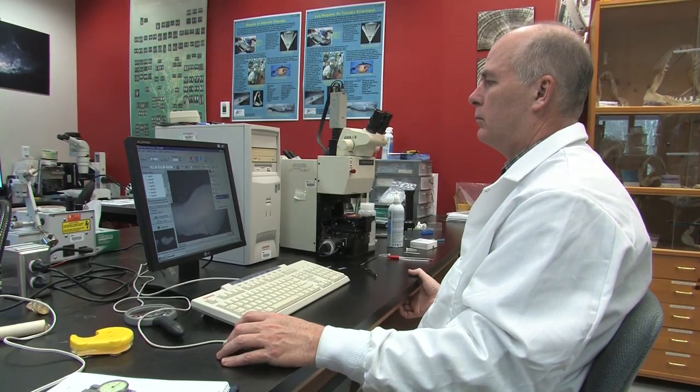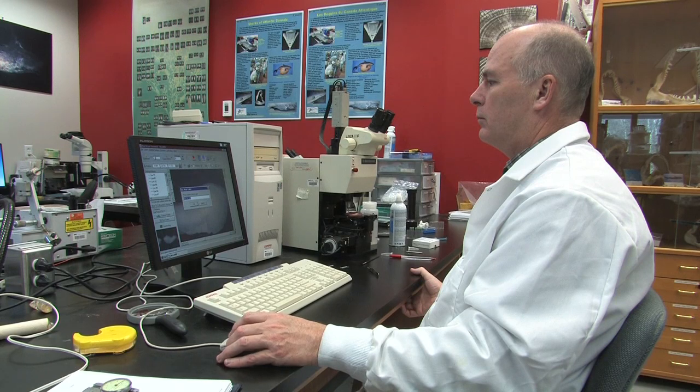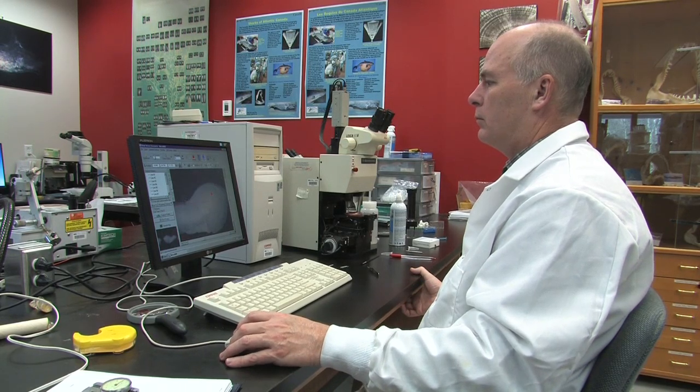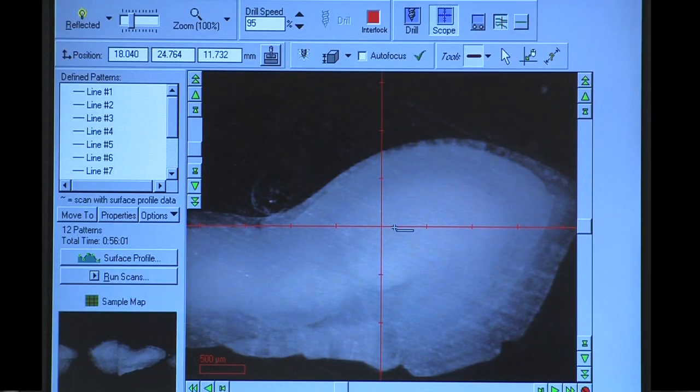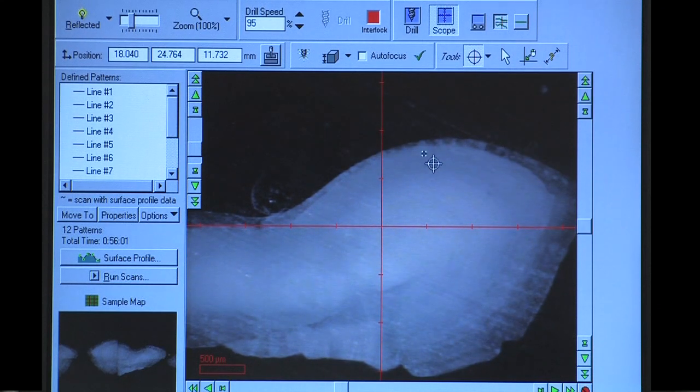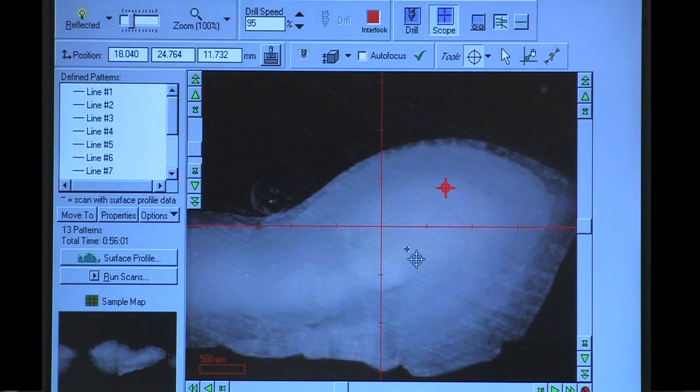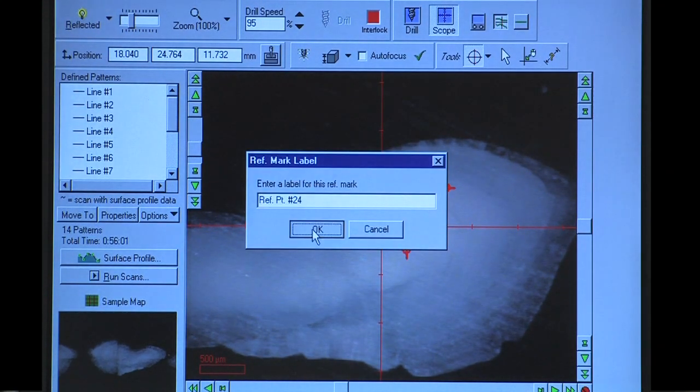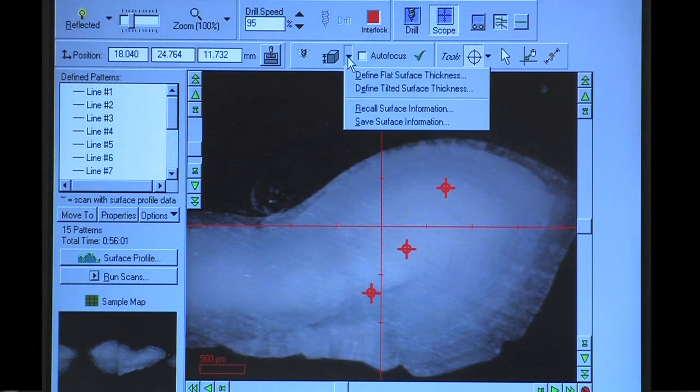For tilted surfaces, set up the micromill as you would when taking a flat surface sample as described previously. This includes calibrating the stages and taking a sample thickness as well. Once done, choose the tools button and the reference mark tool to place three reference marks on the sample. The tilted surface program requires three reference points in the sample in order to compensate for the angle. Then choose the tilted surface button and follow the screen prompts.